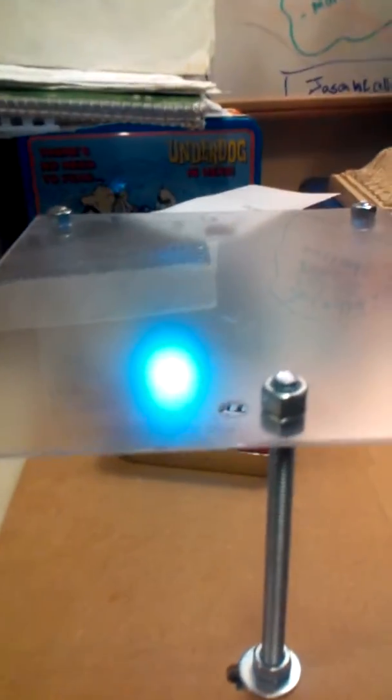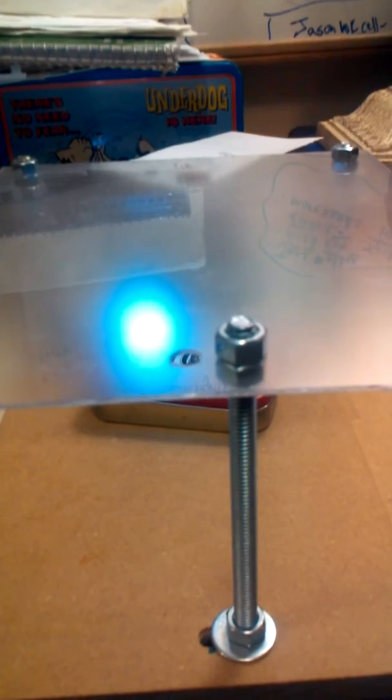Yeah, that's it. It's a great little build. Took me about 20 minutes to put together.